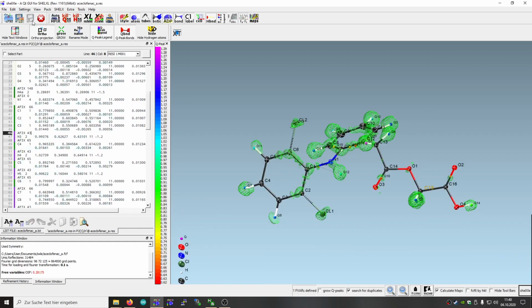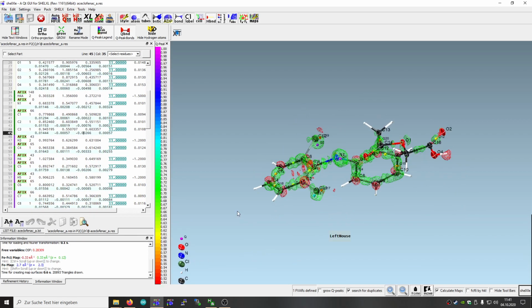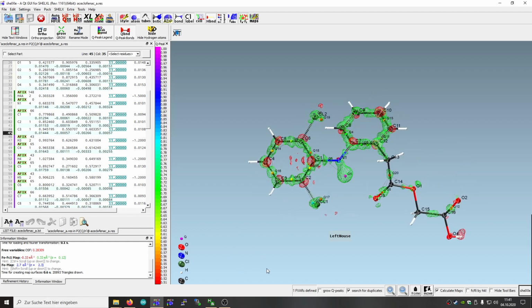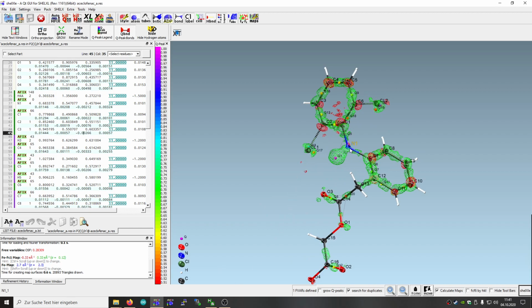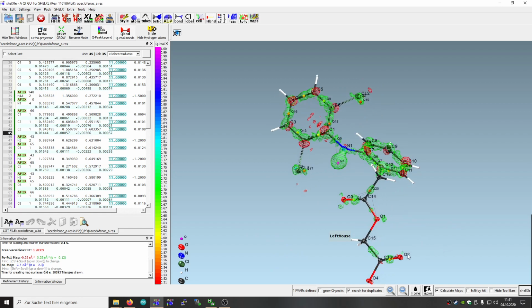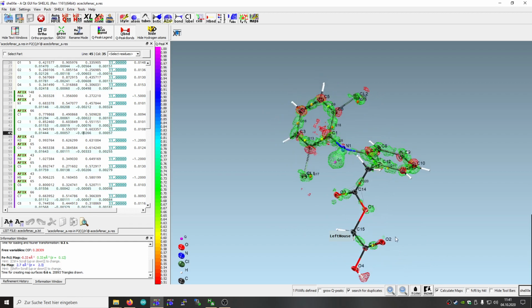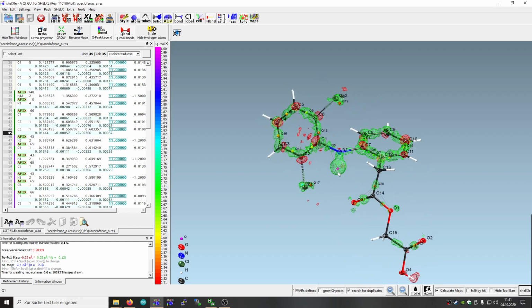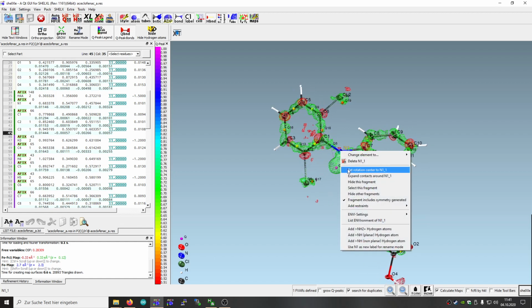So you can just click on save and try to refine that. Seems to work. And we see the program is then able to find a hydrogen appropriate for that nitrogen atom, and we can see that nitrogen atom doesn't have a planar shape for that hydrogen atom, so we just click here right and choose the right option, so not the planar one, the non-planar one.